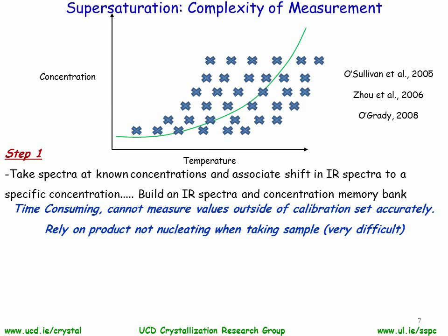So this can be time consuming, and sometimes you can't measure the values that you'd typically obtain in an experiment, as the time to measure can be, say, up to 30 seconds, whereas if you prepare a supersaturated solution, due to the kinetics, the system may only stay in the liquid phase for maybe up to 10 or 15 seconds, obviously based on the kinetics of the system. So this can be pretty difficult and pretty time consuming.